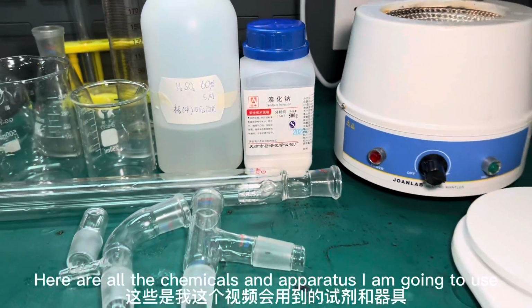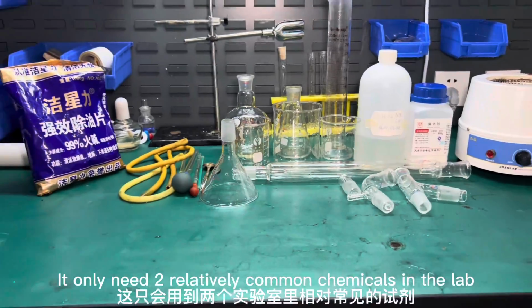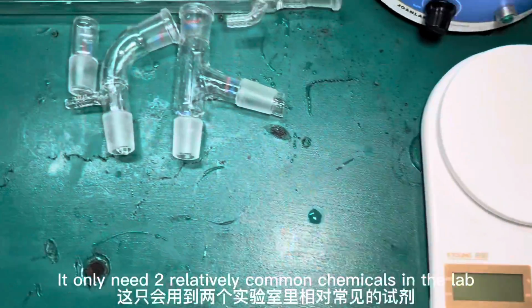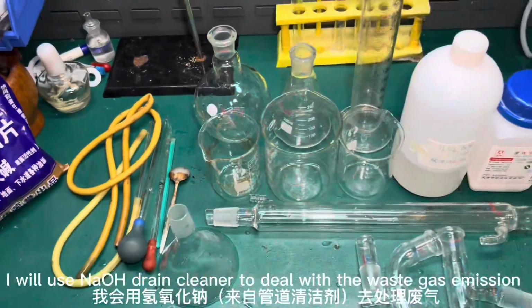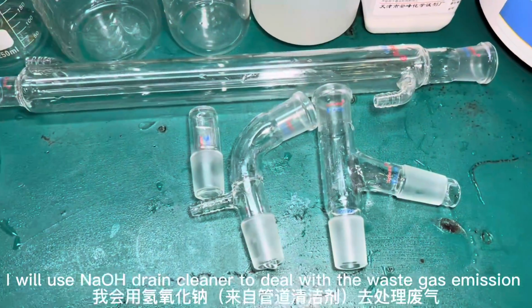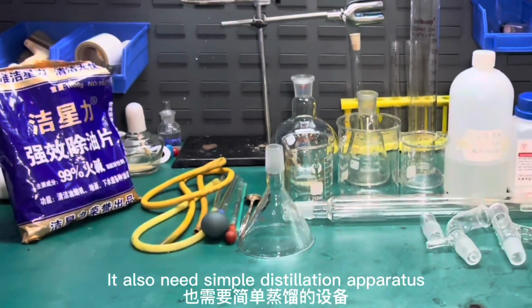Here are all the chemicals and apparatus I am going to use in this video. It only needs two relatively common chemicals in the lab: sodium bromide and 60% sulfuric acid. I will use sodium hydroxide drain cleaner to deal with the waste gas emission. It also needs a simple distillation apparatus.